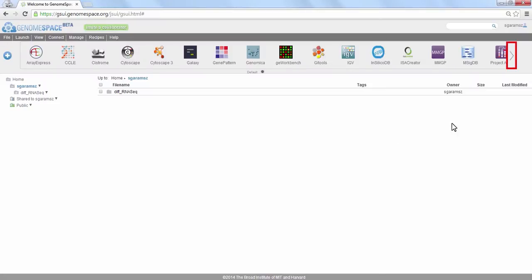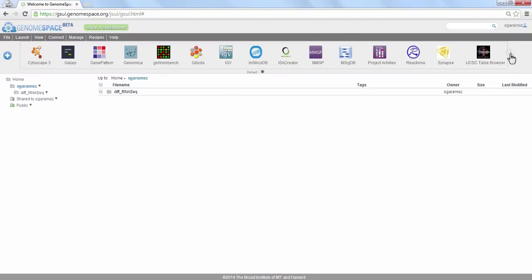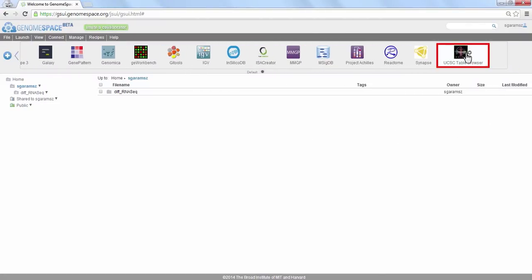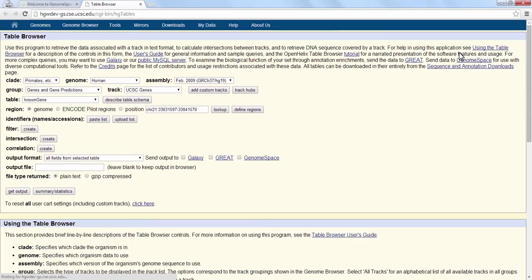Launch UCSC Table Browser from GenomeSpace by clicking on the icon in the toolbar. The Table Browser is a one-stop access point for genomic reference sequence data.